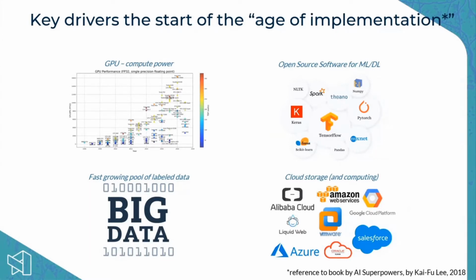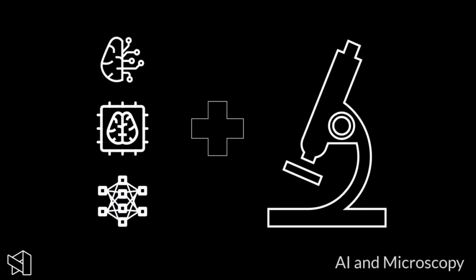And this new beginning that is the last 10 years has been made possible primarily by these 4 key drivers: very fast, cheap GPUs, a lot of annotated data, which we've never had this much, as well as open software and then platforms that allow you to use all of this together. So these 4 components have really made it possible to get to this accelerated rate of use of AI and rate of discovery of AI technology.